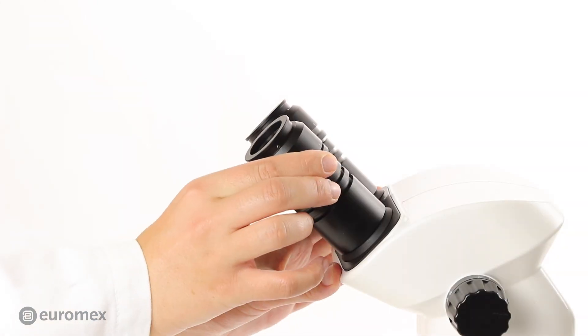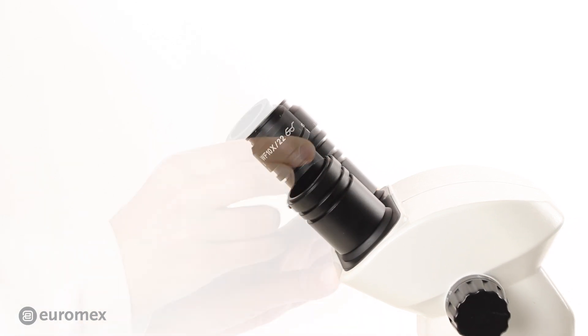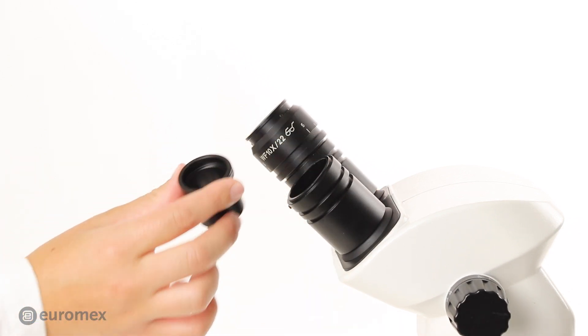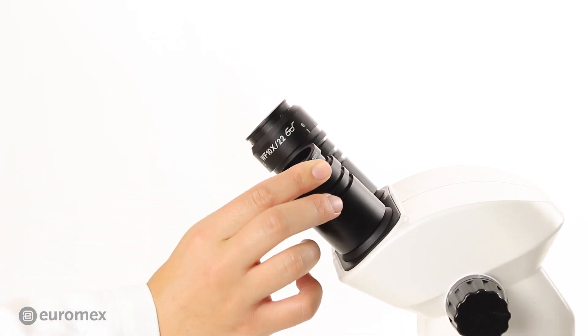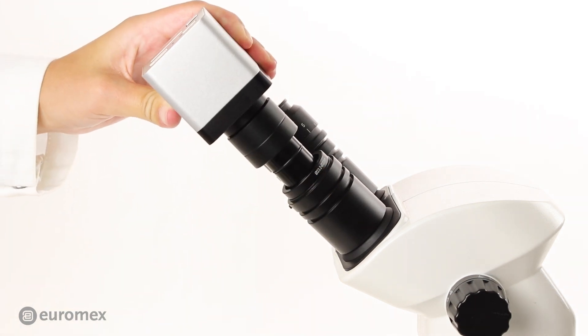How to proceed with a binocular microscope: Remove one of the eyepieces and insert the fitting conversion adapter. Insert the camera with the standard C-mount adapter.